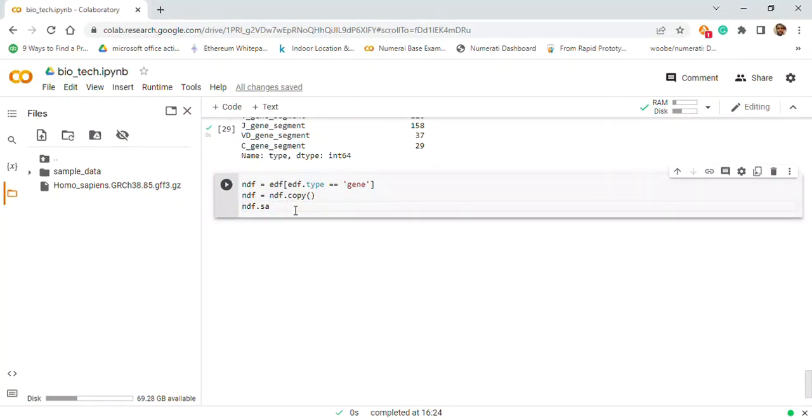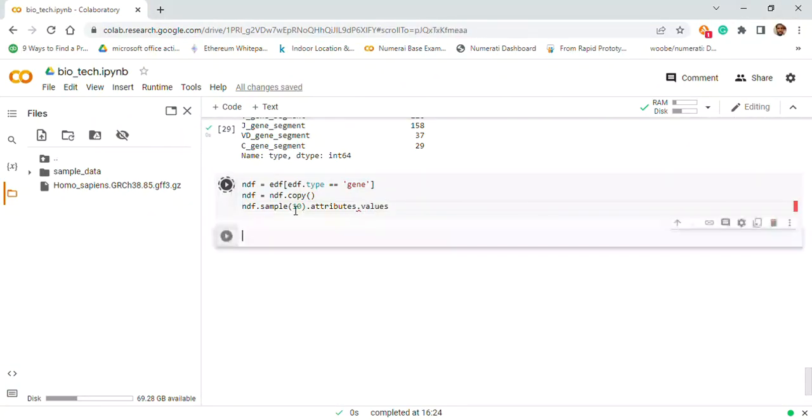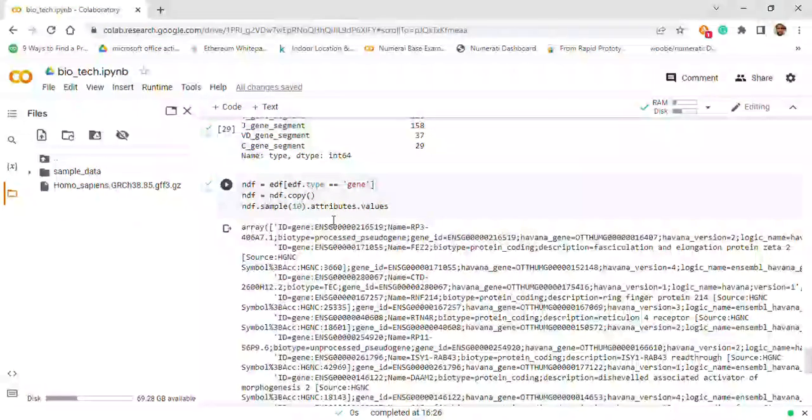The attributes column. And then see the values that are in that column. So these are the values of the attribute columns. So you're going to perform a regular expression. You have to extract this because this is dense information.